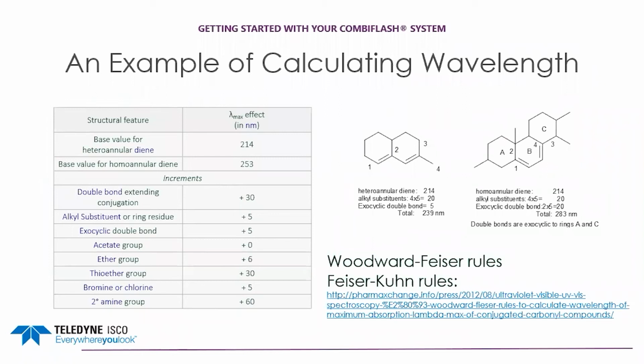Here are some examples for calculating the UV absorbance for a compound. We start with a base value and substituents increase the absorbing wavelength. These values are in the web link from the previous slide that I have copied over here as well. I will pause a second so you can take a picture with your cell phone of that link and you can look at it later.